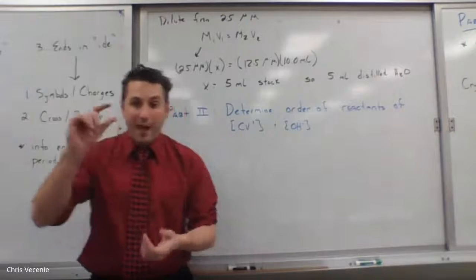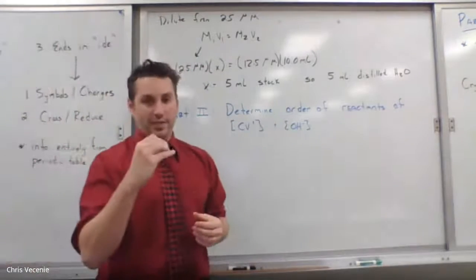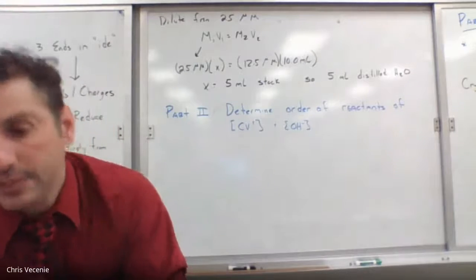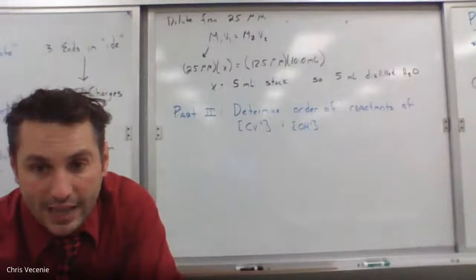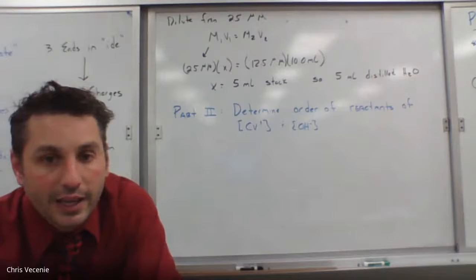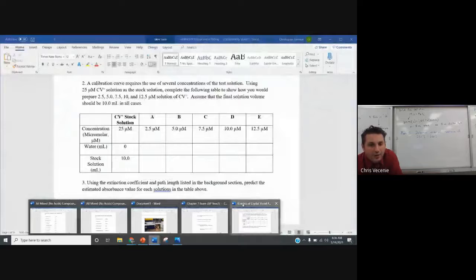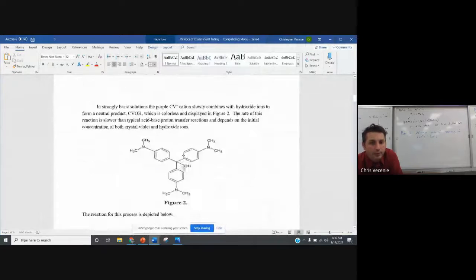So that purple vial in the back is that big crazy structure with the positive sign. Now, when I react that substance with hydroxide, what happens is the hydroxide goes in and it combines with that positive ion to create something new.